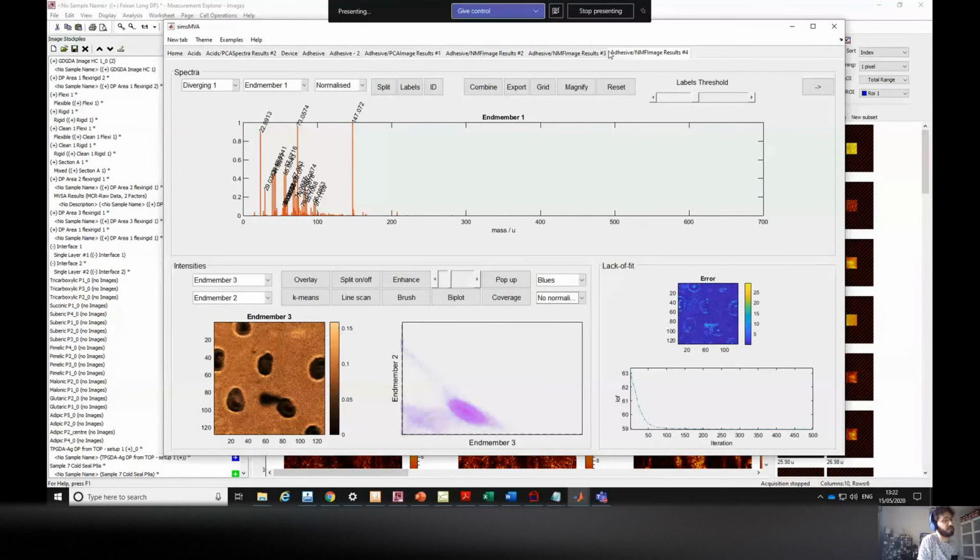It's just, if I don't know anything about it, I would do first, let's say 500, and if it's not converged, I would do more. But if I know that it converges at 500 and I want to do quick tests, I maybe do less. So there was no reasoning. Okay, thanks.